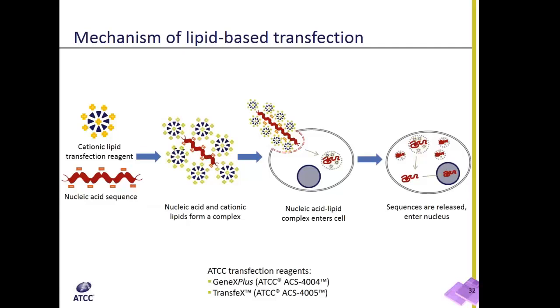Okay, so this schematic details how lipid transfections work, and as I mentioned, this is the technology that we're going to focus on for most of the talk. When I start talking about the various procedures or points to consider for lipid transfection, they generally also are involved in other cell types or other transfection types also. So in lipid transfection, it's simply based on the concept of opposites attract.